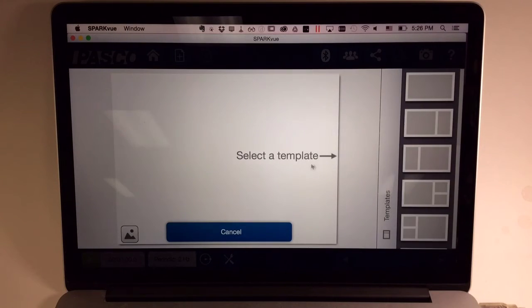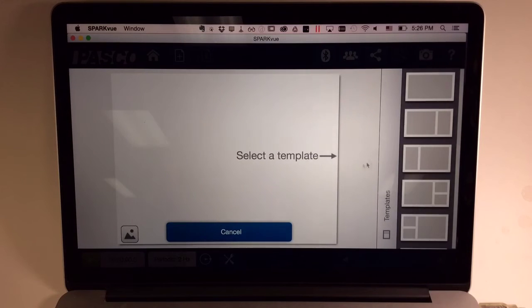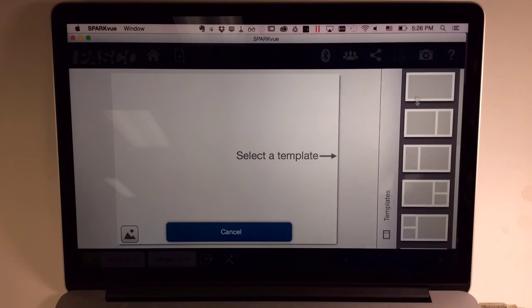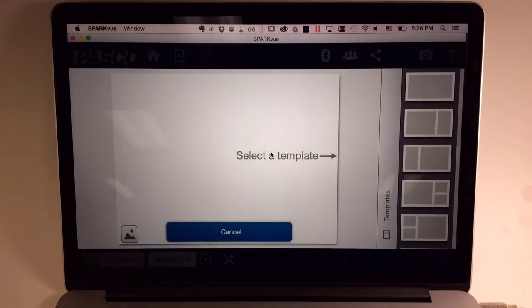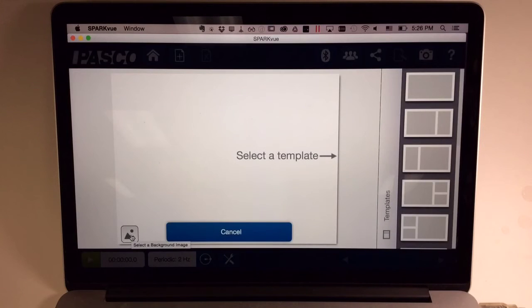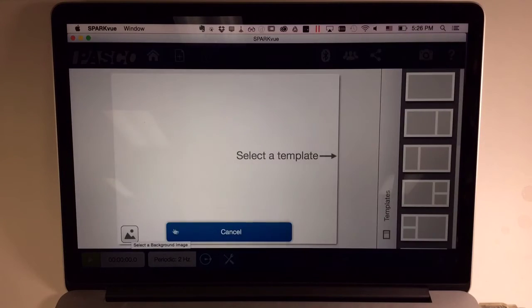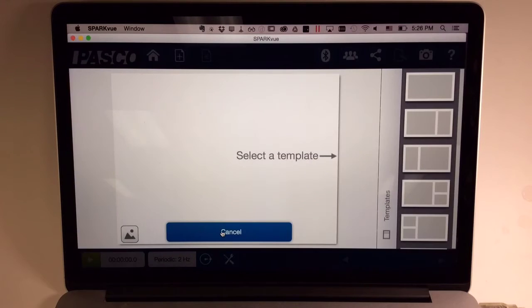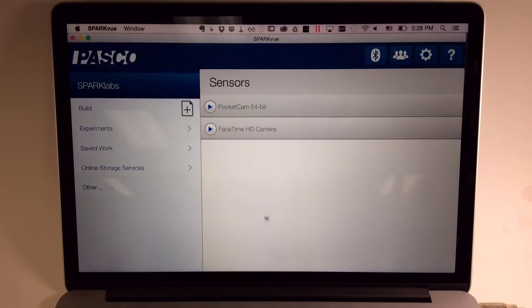You'll notice, however, that the Build screen has changed a little bit to promote what students do most often, selecting a template, and demoted this button for adding a background images which students do rarely. There's also a Welcome Cancel button here in case you want to head directly back to the home screen.